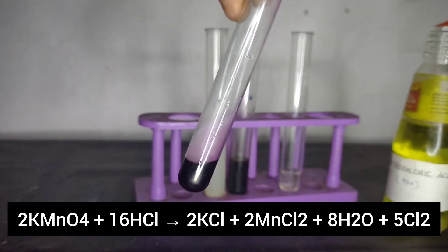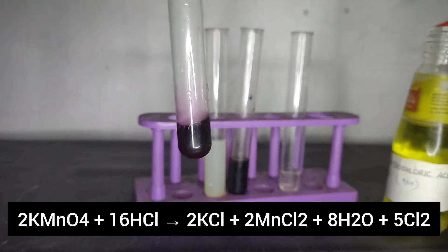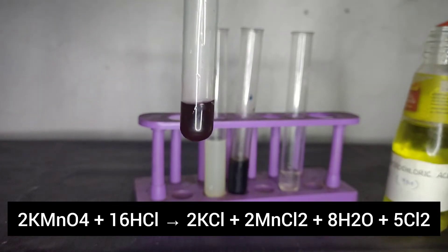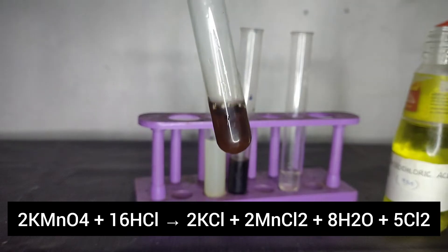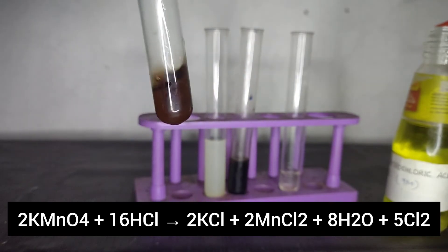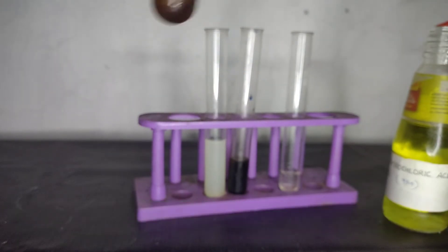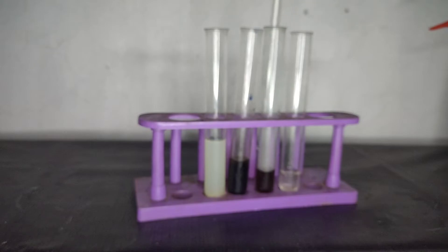Add concentrated hydrochloric acid until the color of potassium permanganate lightens. Now our chlorine water is ready. Add this chlorine water drop wise into this solution.